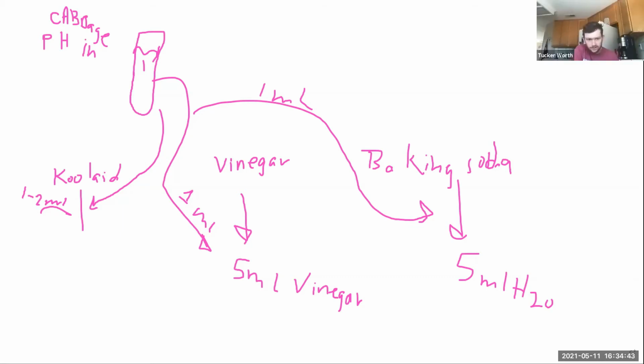It's a weak acid, yes, because we know that all carbon acids are weak acids. And we had baking soda, which I'll tell you is a weak base. When you put those two together, you should also get water and a salt, and that should also be neutral if it balances each other out completely. What you guys are doing is adding an excess amount of baking soda, so your pH should be roughly 7-ish, 8-ish, because neutral is 7 and 8 would be slightly basic.